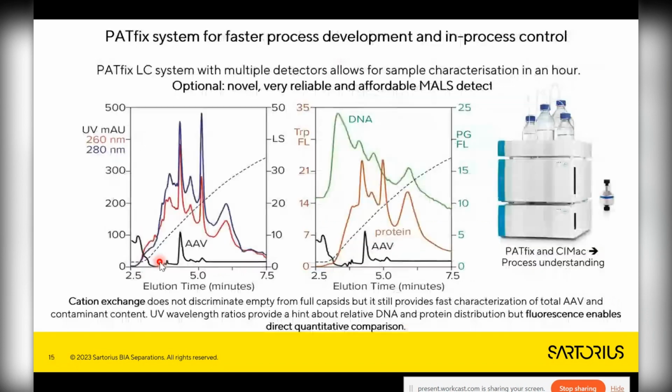And this is why we tried to better understand how to remove not only empties, but also partials and heavies. A very powerful tool which we are using in our development is, as I mentioned, the PATfix.